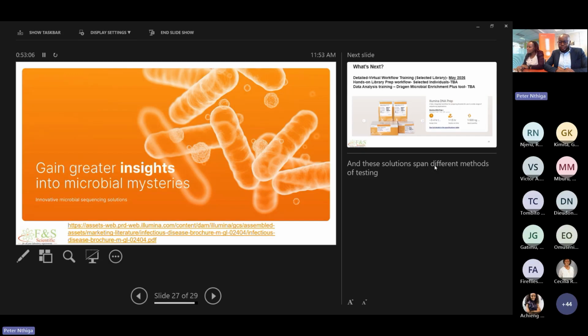And maybe to highlight from the questions that we have answered, because this was a very good point of information: a lot of us are doing our surveillance using PCR and qPCR. And as Peter has highlighted, these have been great tools and very informative tools. But how do we make the decision to now progress towards genomic surveillance to gain more insights and more data?